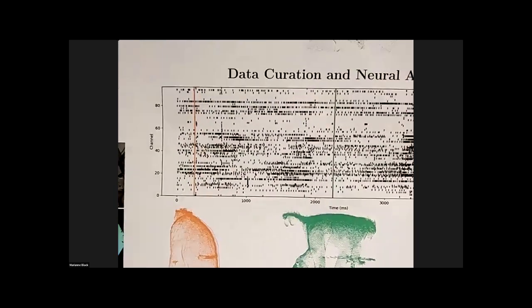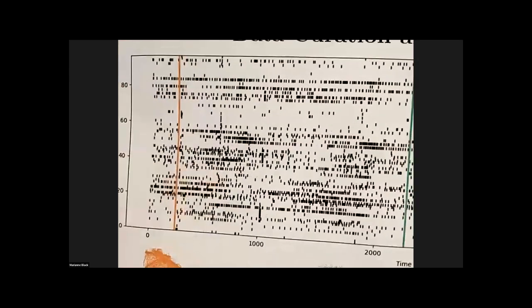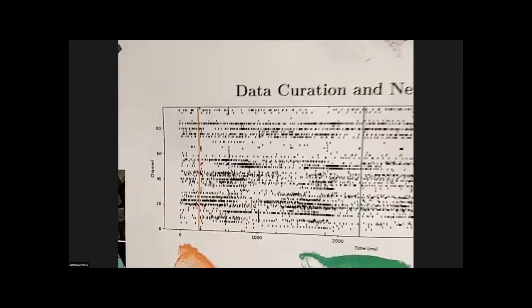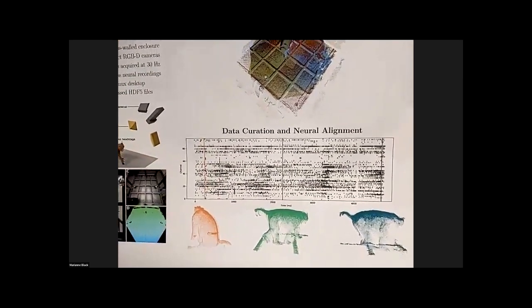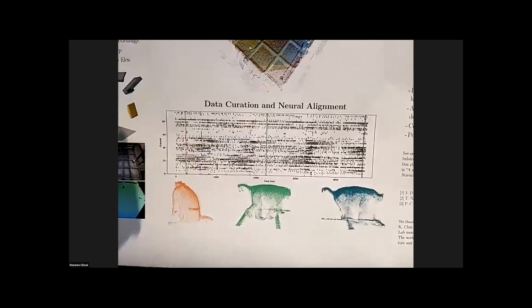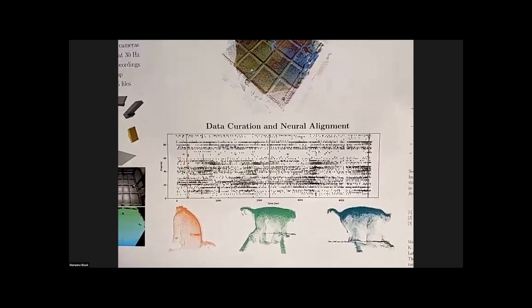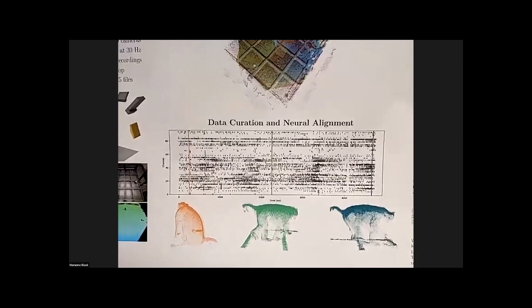And there is a threshold of activity. When the waveform goes up and down, you'll know that, at a certain point, that isn't just noise, right? That is actually a marker where the neuron is firing. So we create a voltage threshold, and if the voltage crosses that threshold, we know we have a spike. From those spikes in time, we can create these spike rasters, where all these vertical lines just denote when a spike happens in time. So it's a way to take this information-intensive analog data and make it into something that's still very useful, but from an information perspective, less information.